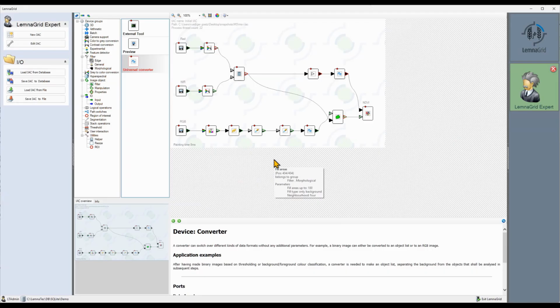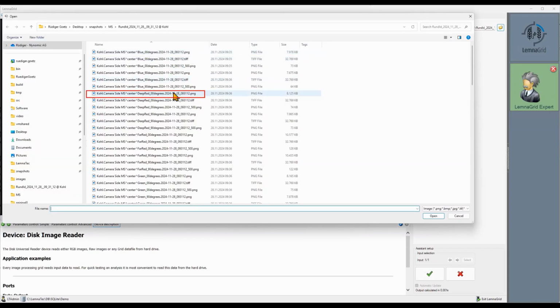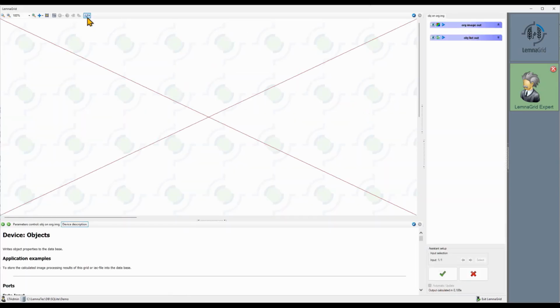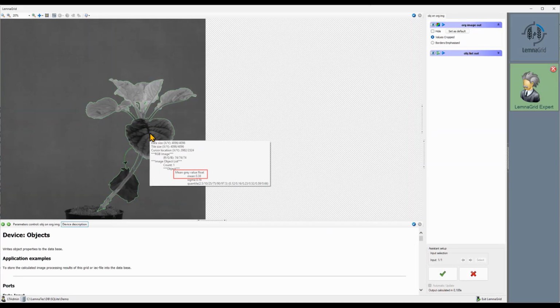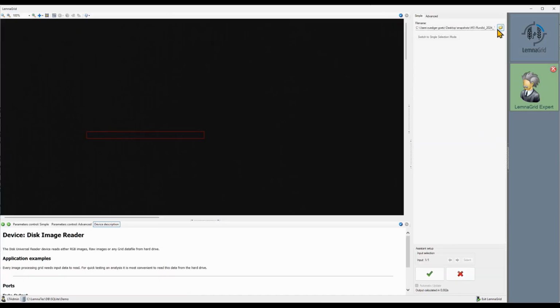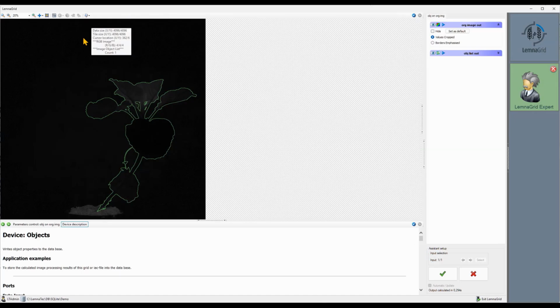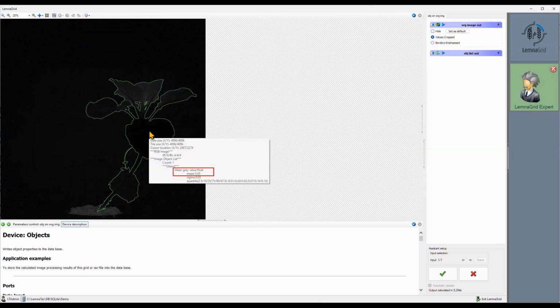We may do a few variations to this grid. We could use the deep red instead of the normal red. This gives an average NDVI of 0.38. If we use the far red, we get almost no NDVI value. The NDVI value is now at 0.05. This is because the far red is already too deep inside the red edge.